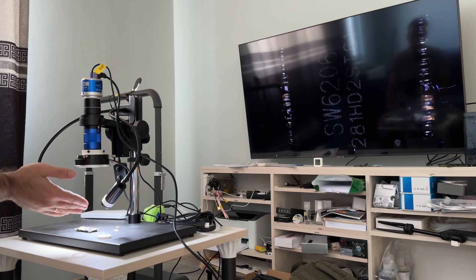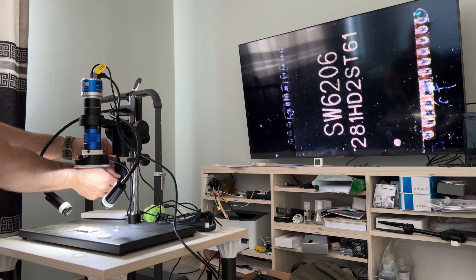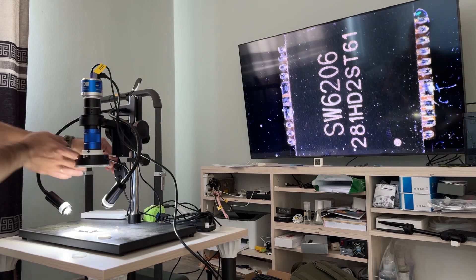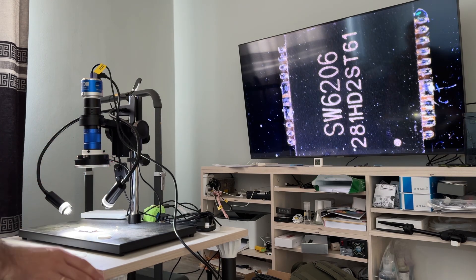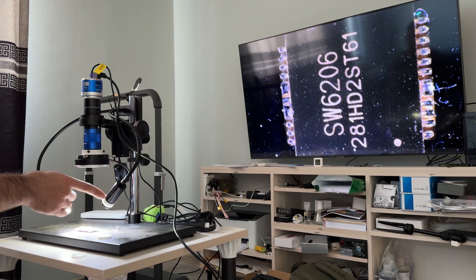But with our DIY light — wow! We can see everything. And this is max polarized light. So for 20 dollars you can add cool polarized light to this.